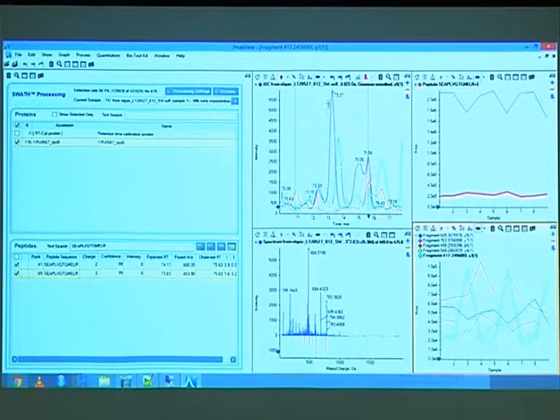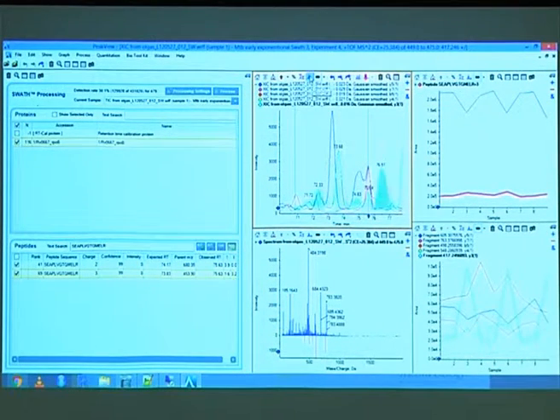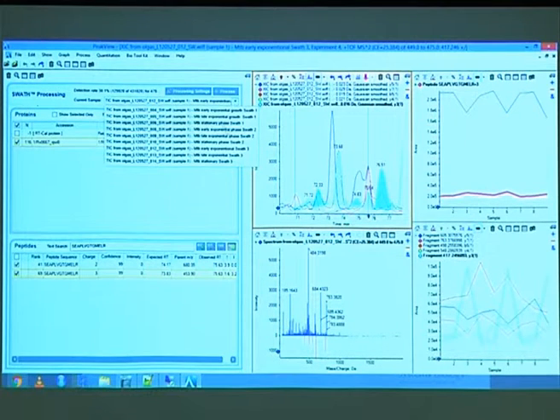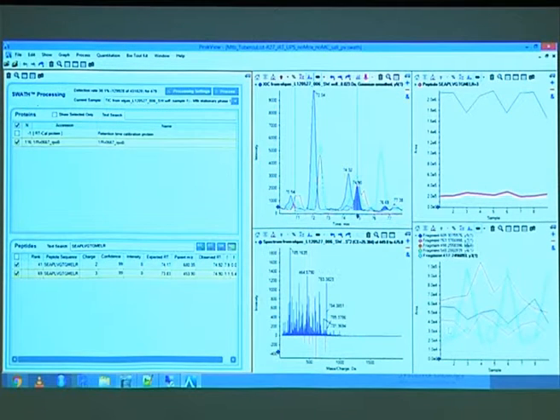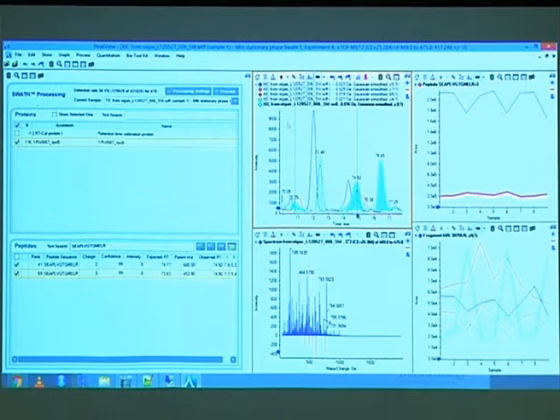And what you can do again is click down here and highlight the area of the peaks, and you see now there is 1 tall one here, then 3 smaller ones, and there's another tall one coming here. And if you look now in file number 3, so this was the one that I just showed you, this is the one that is displayed now. If you go to that one, what you see here are the 2 tall peaks, and this one here is these 3 all together, and that's likely what has happened for all these 3.